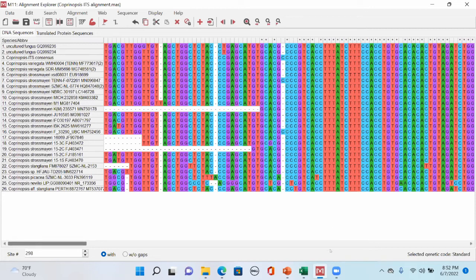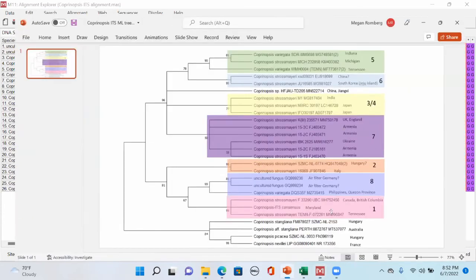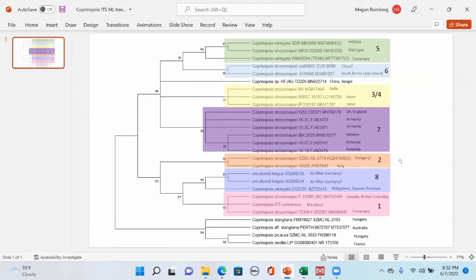Right. If you get this kind of readout, are you able to make your own guess as to whether that seemed to be a reasonable name to apply to it? Well, what you get after that alignment when you do the phylogenetic tree could be something like this, where in pink was our sequence from Maryland, and that matches up to some other sequences from parts of North America.